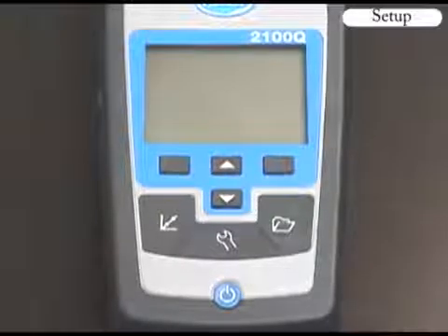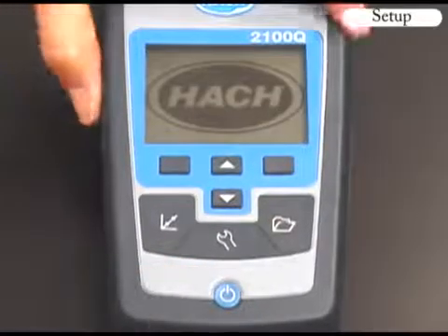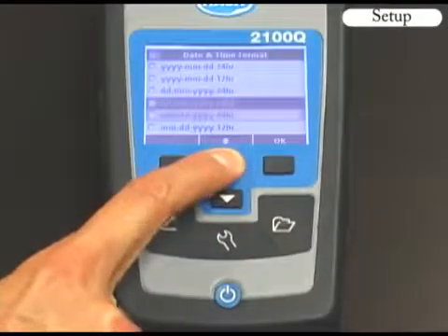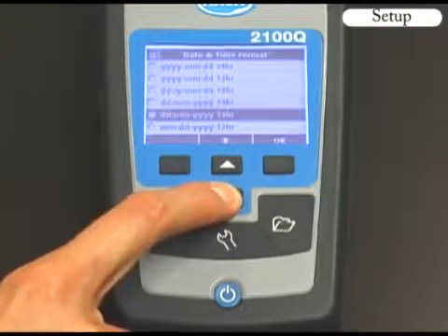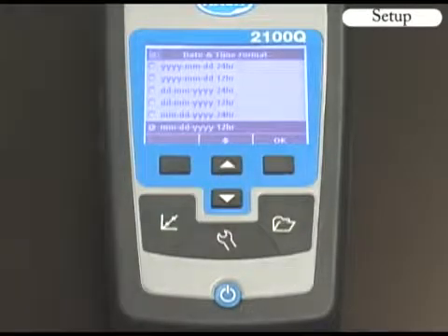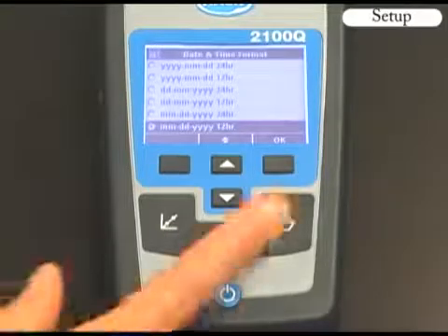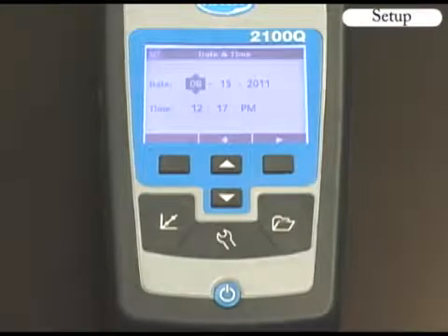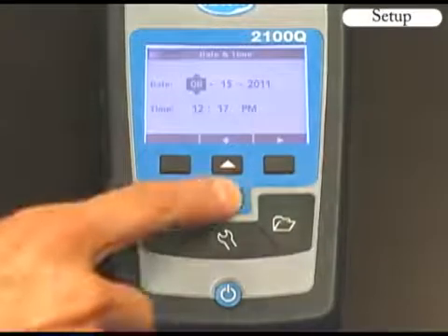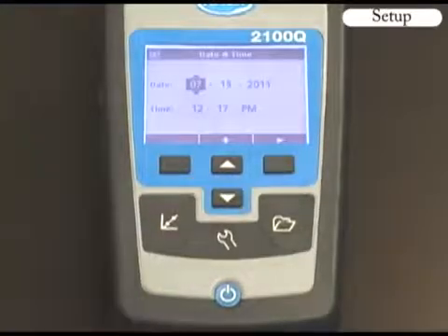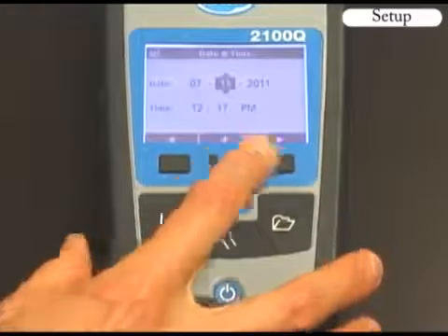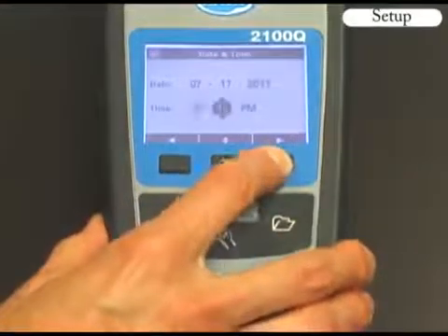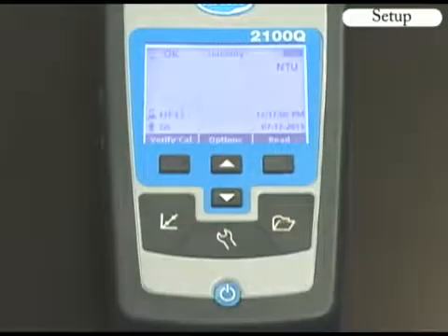When you turn the instrument on, you will be prompted to format the date and time. Use the up or down keys to scroll through the menu screen to find the date and time format that you wish to use. For this demonstration, I will select month, day, and year with a 12-hour time format. Use the up or down keys to select the month, then use the right key to scroll to the next option. When the date and time are formatted, push the right OK key to save the information.